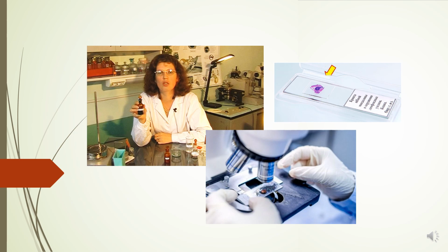A histological specimen is a slice of an organ with a thickness ranging from 5 to 10 micrometers after pre-processing and staining with specialized dyes. The ideal microscopic preparation is preserved so that the tissue on the slide has the same structural features it had in the body. Let us consider the main stages of tissue preparation for examination under the light microscope in the conditions of the histological laboratory in manual mode.